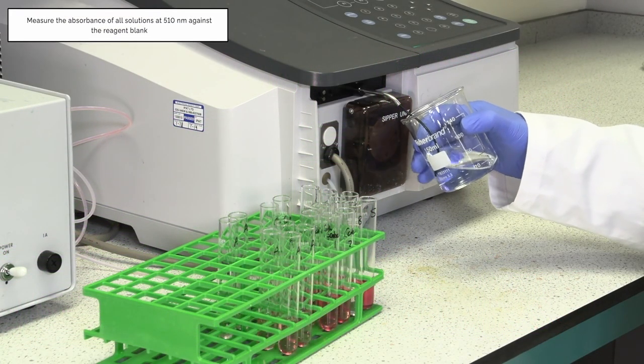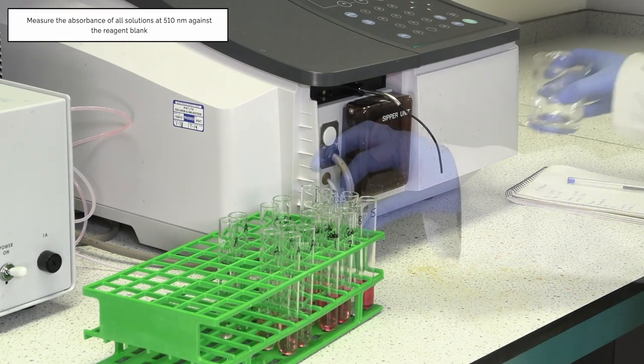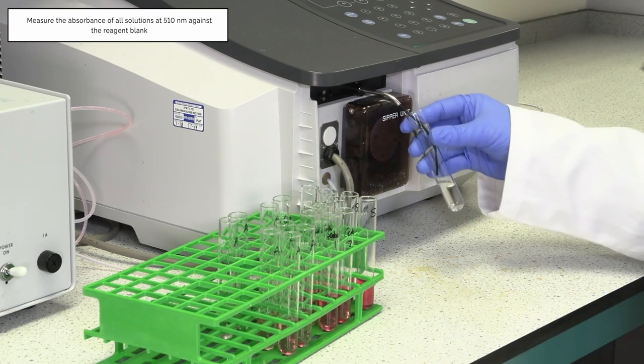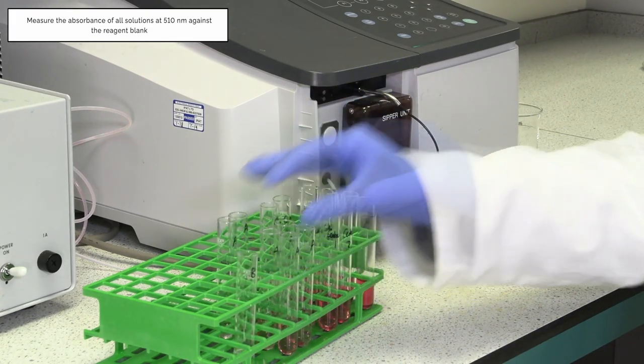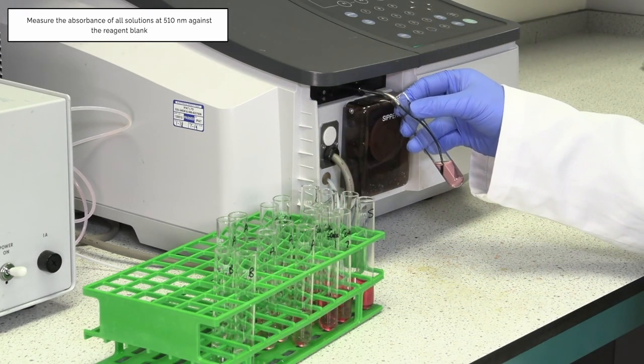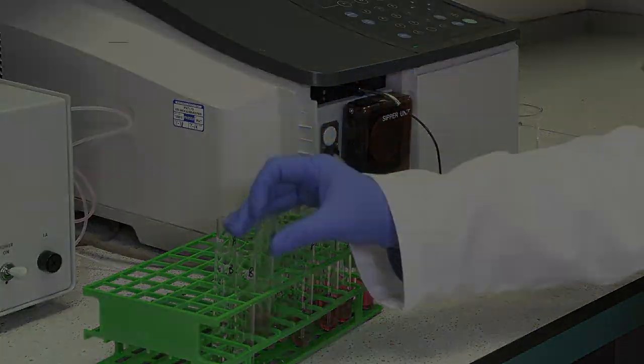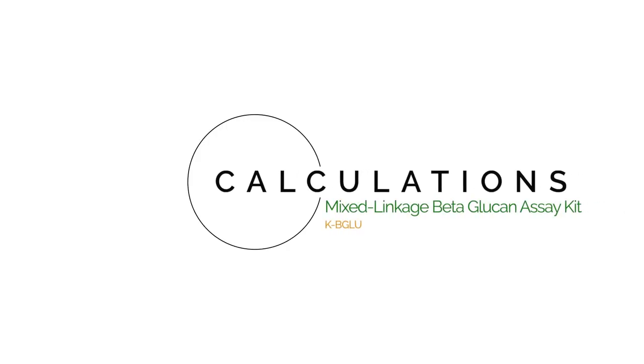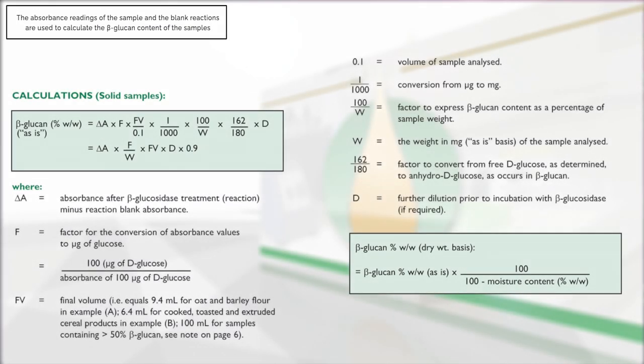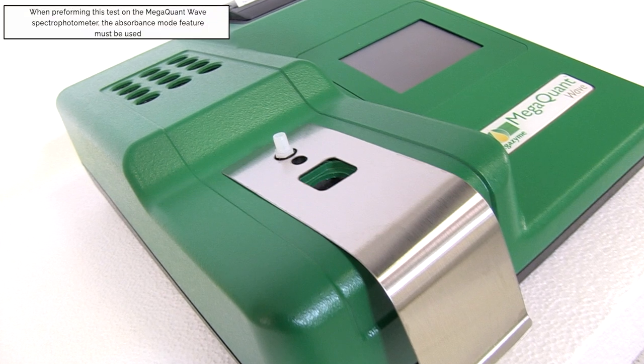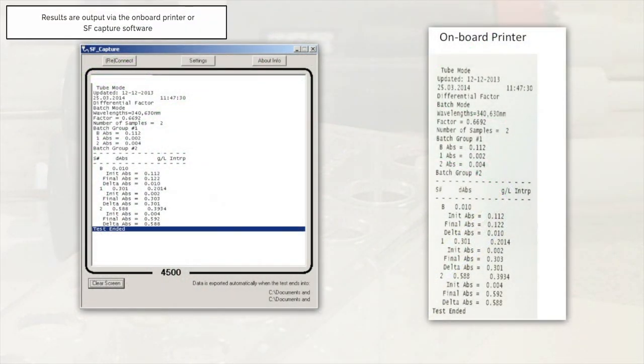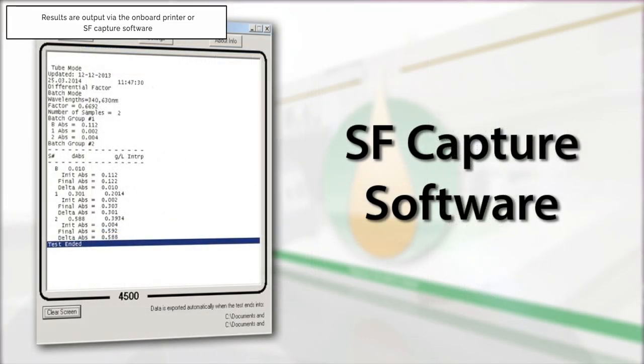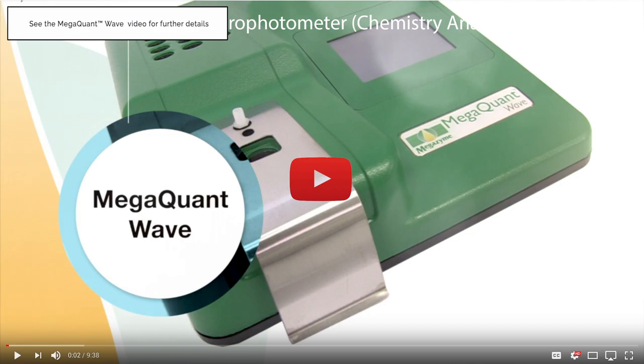Measure the absorbance of all solutions at 510 nanometers against the reagent blank. The absorbance readings of the sample and the blank reactions are used to calculate the beta-glucan content of the samples. When performing this test on the Megaquant Wave spectrophotometer, the absorbance mode feature must be used. The results will be printed via the onboard printer or the data can be exported to a computer using the SF capture software. Please see our Megaquant Wave video for further details.